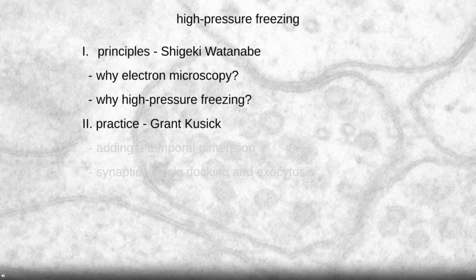And so now I'm going to hand this over to Grant Kusick, who is going to talk about how we can actually add the temporal dimension to electron microscopy, because all of these samples that you are looking at are basically static images of tissues that are fixed or frozen. And so, Grant, take it over.